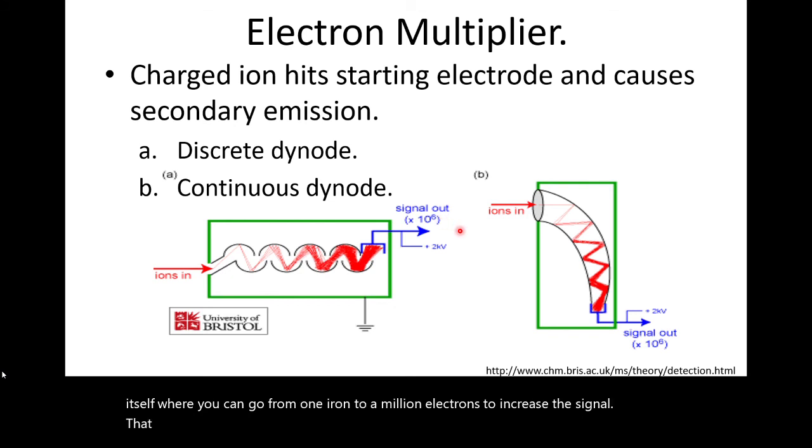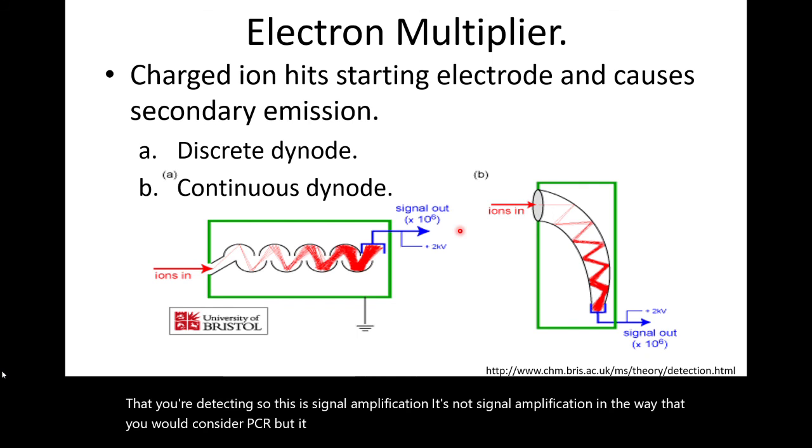So this is signal amplification. It's not signal amplification in the way that you would consider PCR, but it does amplify signal quite considerably.